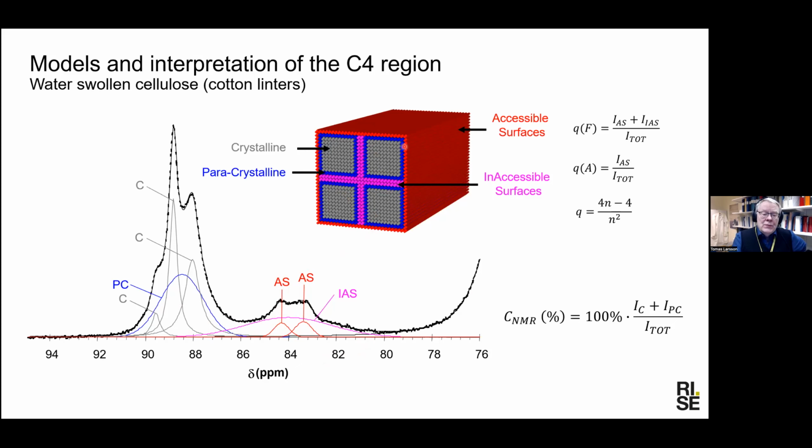But we can, based on this part of the spectra, establish experimentally a surface to volume ratio, or the total number of polymers in a cross section compared to the polymers around the perimeter of the cross section, whether it's for fibrils or the fibril aggregate. And since a polymer has a pretty much constant thickness, we can take measures of the lateral size of fibrils and fibril aggregates, as long as we have a cross-sectional shape, which we assume to be a square.